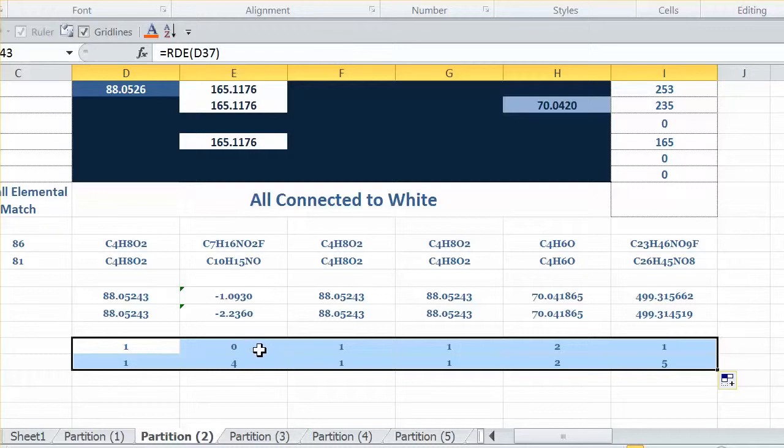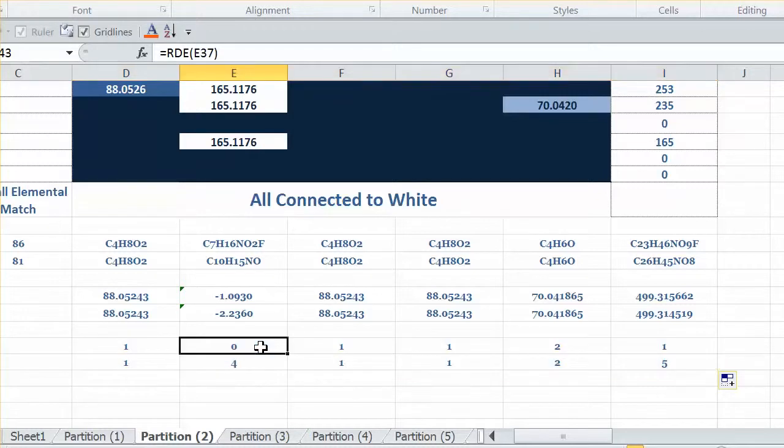Now, if I see a zero, some compounds, like for example, if we had an ethanol here with 0 rings and double bonds, we know that ethanol cannot connect to 4 other subfragments, so that would rule it out. Now in this case we have a nitrogen and 2 oxygens, and since it's saturated it could be 2 alcohols and a primary amine, let's say.